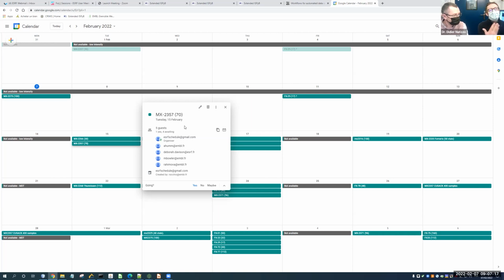Don't wait for the day the beam time has been allocated to fill up the shipment, because as Matt would say, if we are in advance, which is very often the case, then we don't like having to wait for the shipment to be done and sending emails to people saying, could you do the shipment because we want to process your sample. So please, as soon as you send the shipment, put all the samples in the shipment and ready to be collected. That helps us a lot.